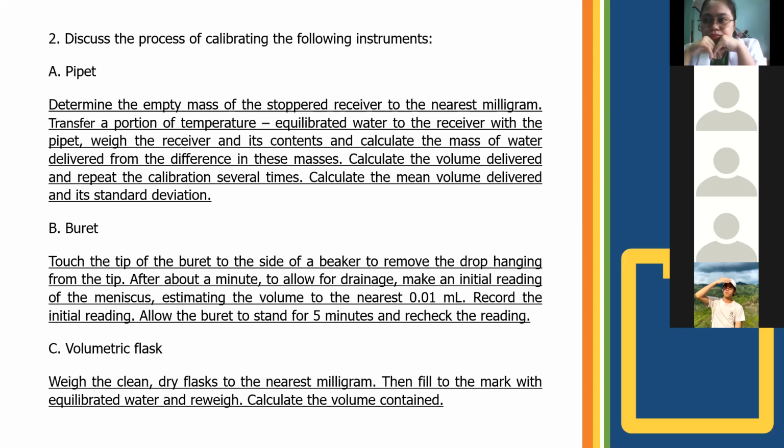The last one is the volumetric flask. Weigh the clean and dry flask to the nearest milligram, then fill to the mark with the equilibrated water and reweigh, and calculate the volume contained.